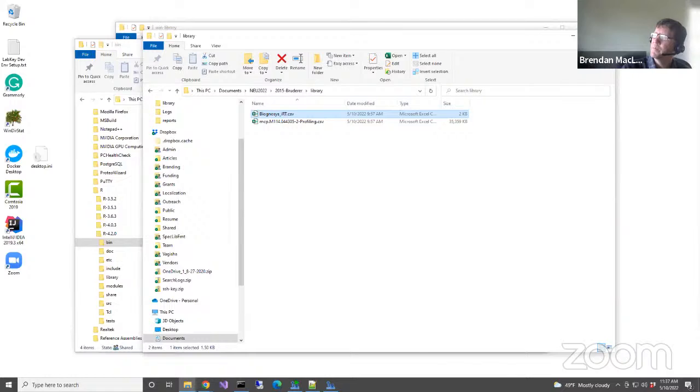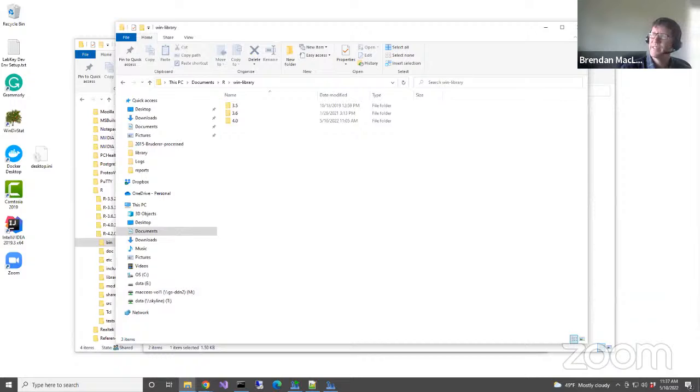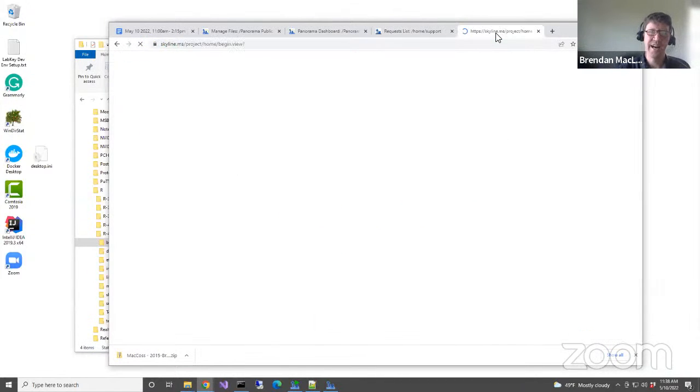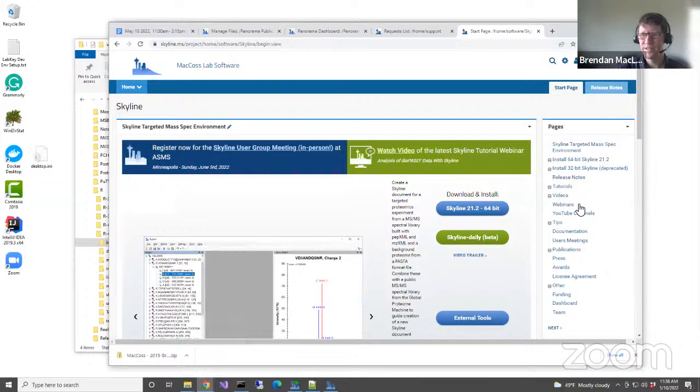How do we prepare an IRT file? I'm not quite sure what that's saying, but anyway, IRTs are a whole other subject, and I've spent an entire hour explaining it. There's a whole tutorial on IRT, and I would also still highly recommend doing more of the tutorials.